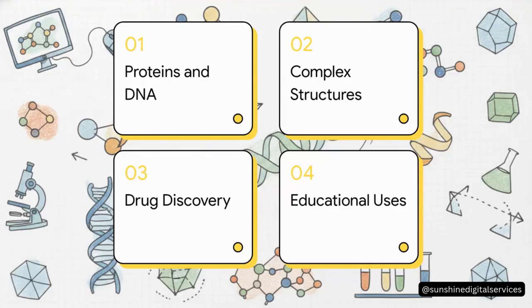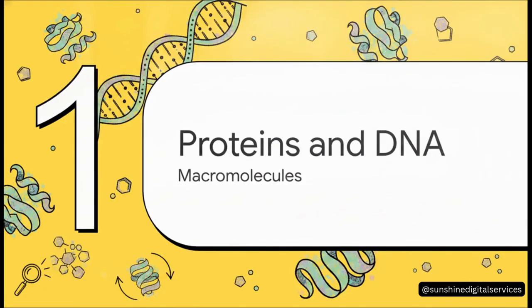Okay, let's dive right into this roadmap. Our journey today goes from single molecules all the way out to global drug discovery. First up, visualizing proteins and DNA. Then, exploring complex molecular machines. Third, accelerating drug discovery. And finally, education and accessibility. So, starting with part 1. Visualizing proteins and DNA, the fundamental building blocks.